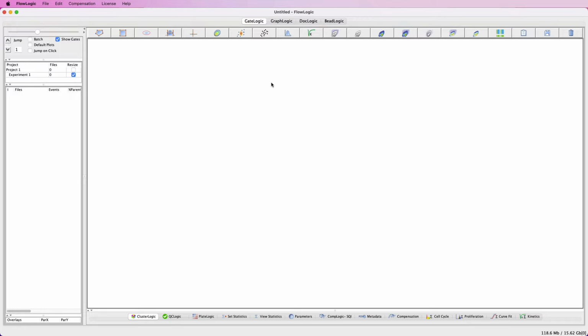It's also worth noting that if you're using a floating license, which acts as a virtual dongle, you can release your license from within FlowLogic or even from your online account. This means sharing your license between different computers or different users is very easy.